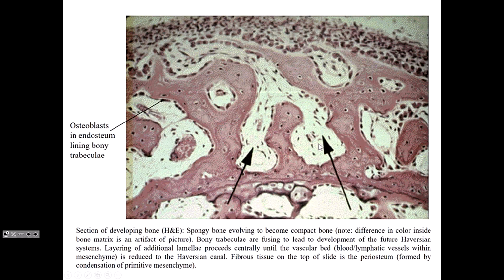Yes. Up here, that's the periosteum. Periosteum, next to the bone, right? Peri next to osteum, bone. Periosteum. So endosteum would be this stuff on the inner surface. Endosteum is much thinner. So endosteum is going to be on the inner surface of spongy bone and perhaps next to the bone marrow cavity. And it's much thinner. It may just be one layer thick, being the osteoblasts. Okay, questions?